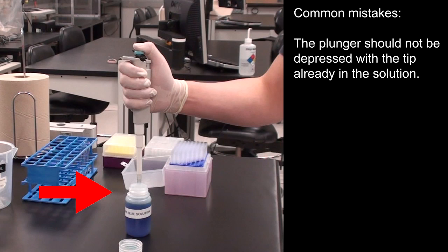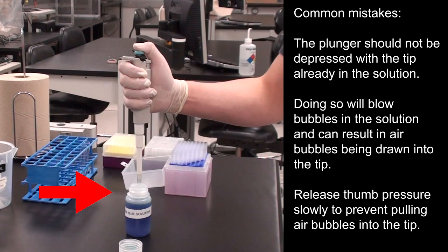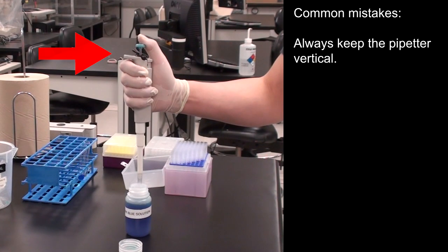The plunger should not be depressed with the tip already in the solution. Doing so will blow bubbles in the solution and can result in air bubbles being drawn into the tip. Release thumb pressure slowly to prevent pulling air bubbles into the tip.